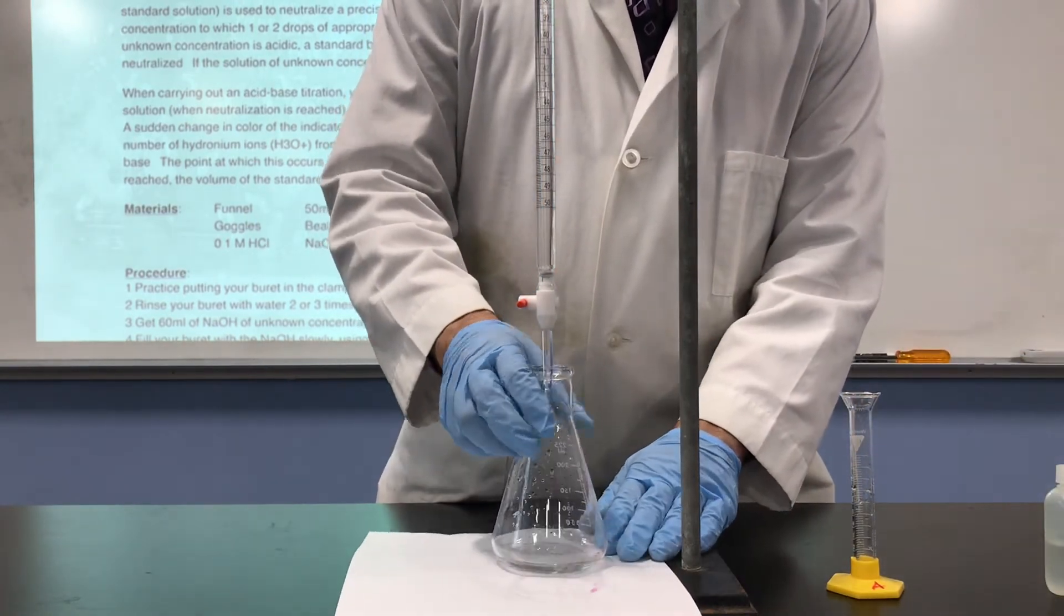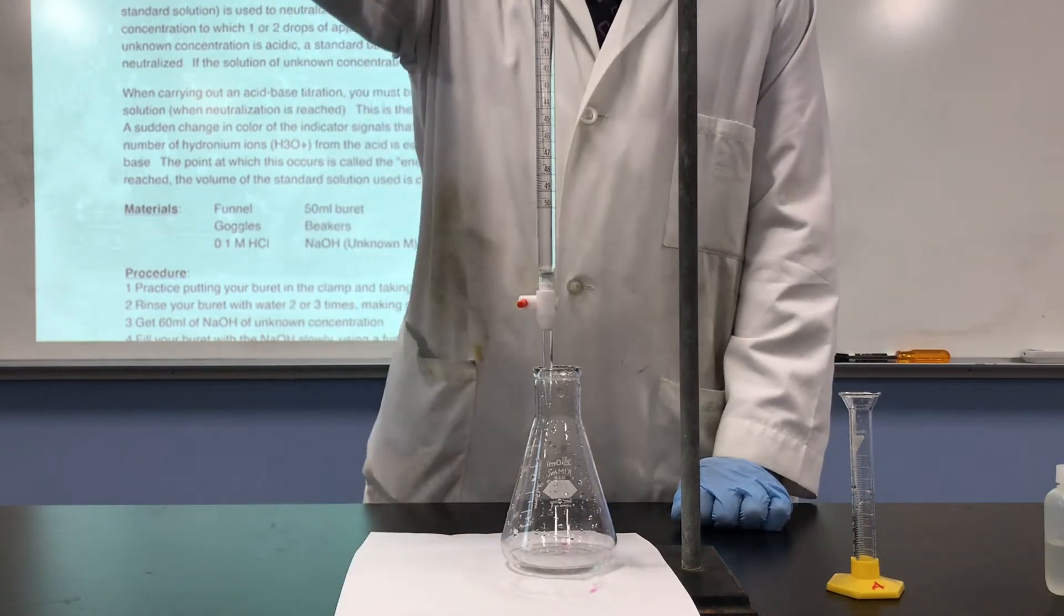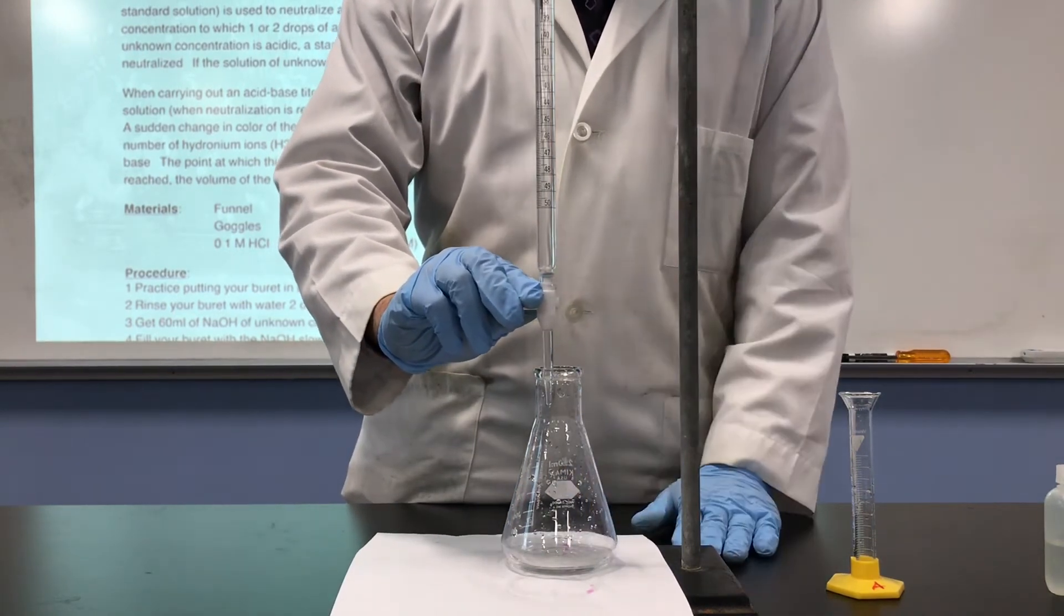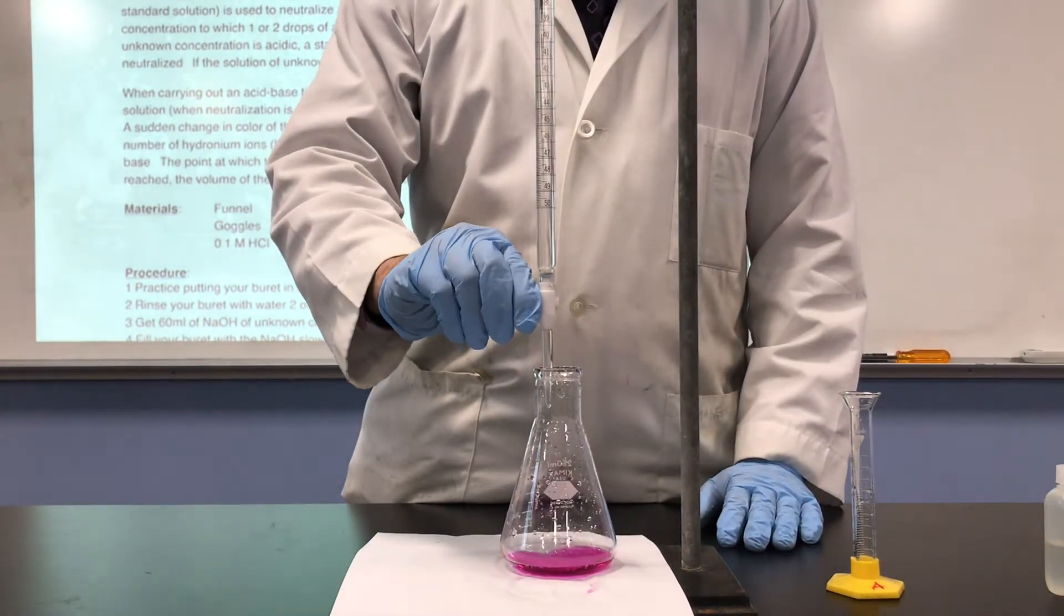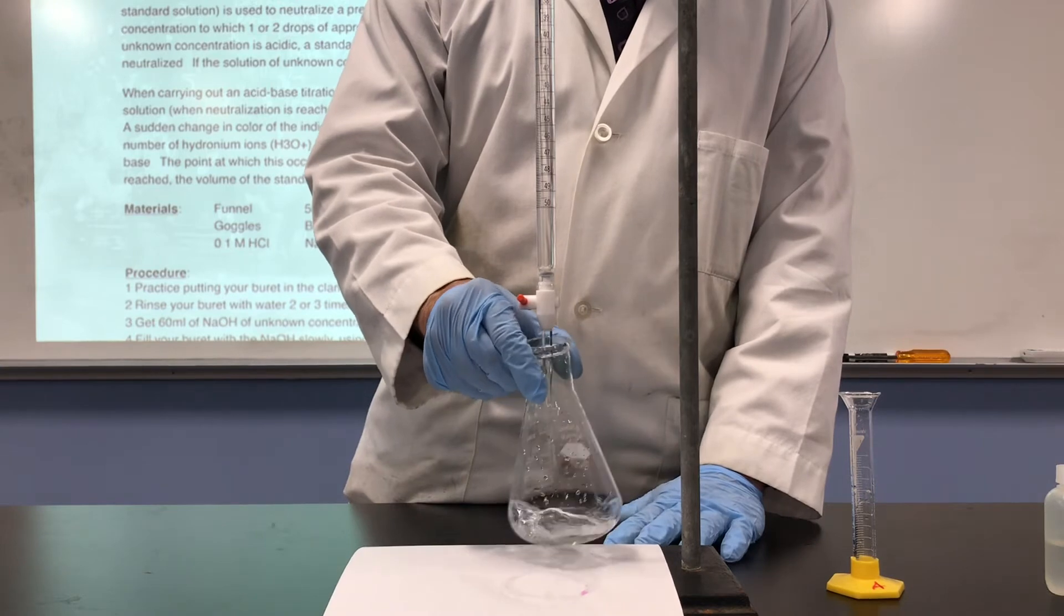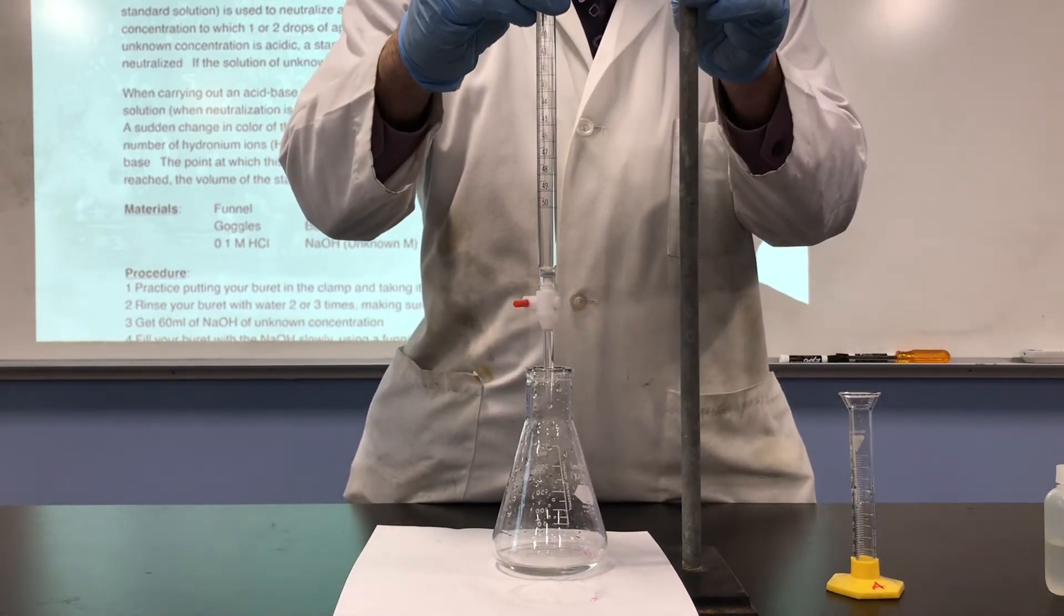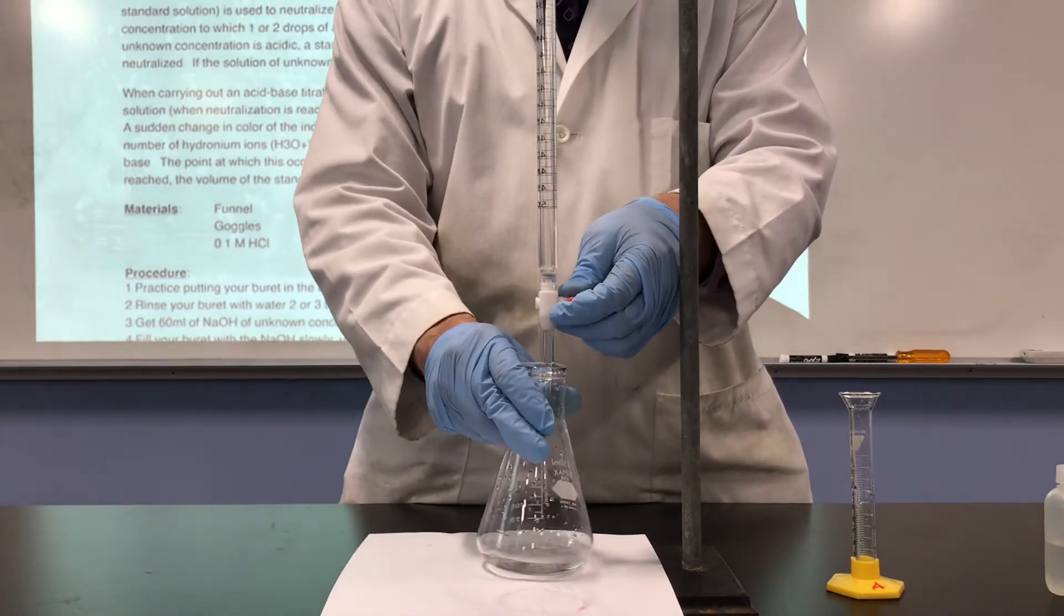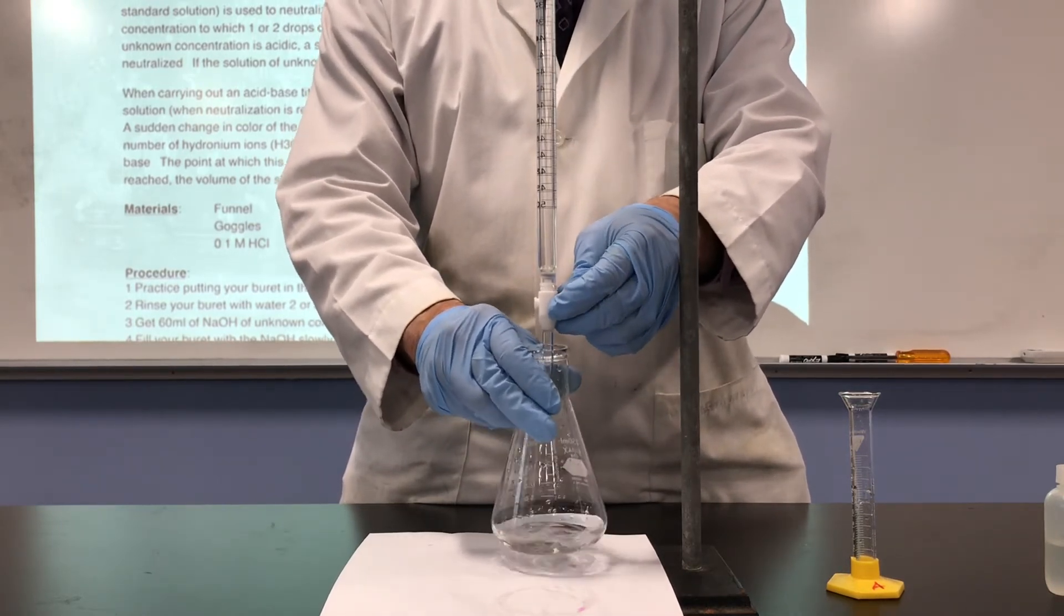Now remember, at the end of trial one, we ended up with the burette at 6.7. We're not going to start off at zero this time. We're going to start off at 6.7 where we left off last time. So quickly, I'm just going to drop about six milliliters in there, a little bit less. I'll go down to the 12 mark to make it go a little bit quicker. So I'll drop until the burette reads 12. And you'll see it's pink, but when I swirl, the flask goes back to clear or colorless. Now when I perform this, I'm going to turn this a little bit the other way around so I can have my left hand on the stopcock and I can swirl with my right hand. Now I'm going to be very careful when I swirl. So I'll put a drop or two drops in and swirl.